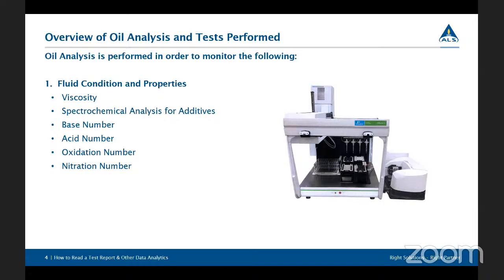Next, we can look at different parameters that sometimes those additive packages give, which is a base number. A base number is kind of how alkaline the fluid is, how much the fluid has the ability to fight off acid buildup. Then we have another test, which is acid number, where we can actually look at the acid building up in that fluid. We can look at oxidation occurring. So unfortunately, almost 99% of the time, all fluids are in an environment where they come in contact with oxygen. And as we know, almost everything oxidizes. Metals begin to oxidize. Well, fluids do the same thing.